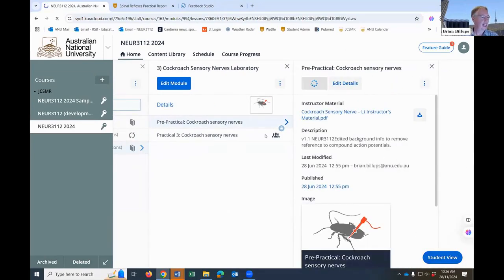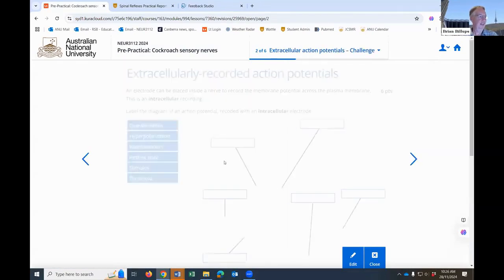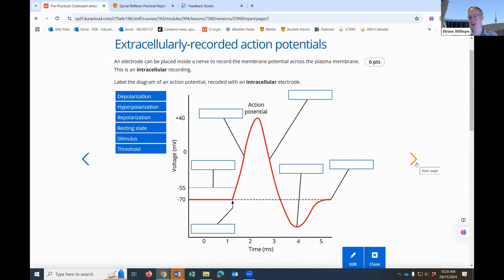We then stick electrodes in the cockroach leg. It used to be, when we had more time, and also if we could get really big cockroaches, the students would dissect the cockroaches themselves. That was when we had a researcher at ANU working with cockroaches, and he could grow us nice big ones and supply them. Now we get them from the pet store.